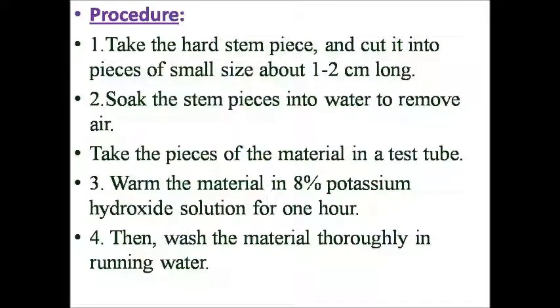Procedure: Take the hard stem pieces and cut them into small pieces, about one to two centimeters long. Soak the stem pieces in water to remove air. Then take the pieces of the material in a test tube.